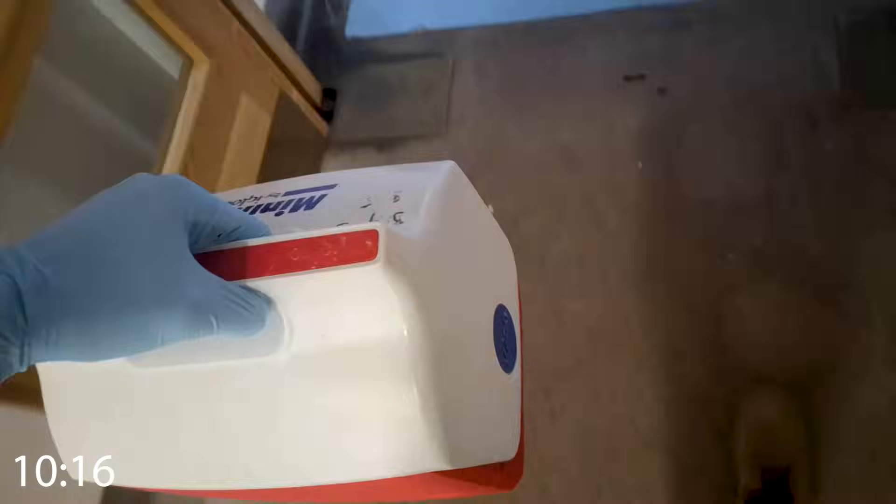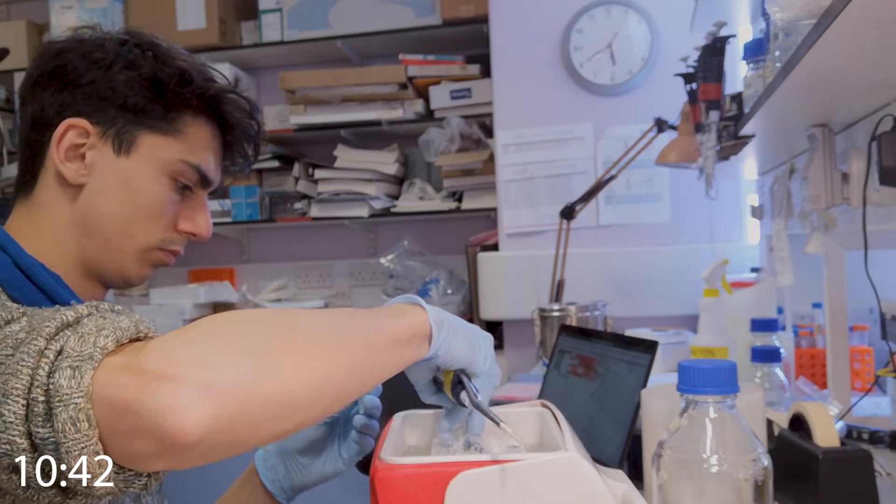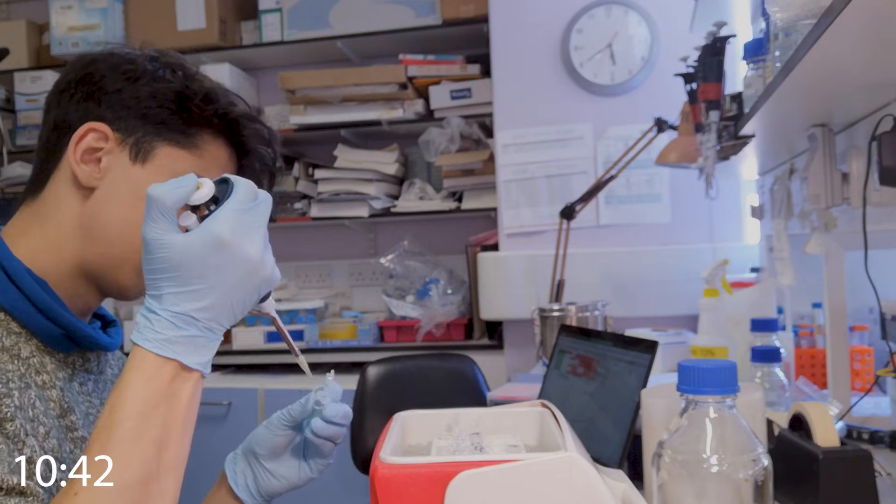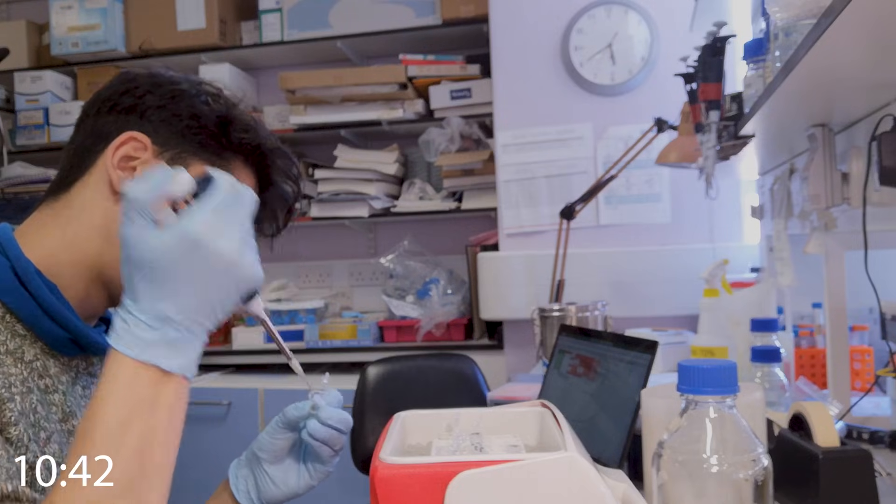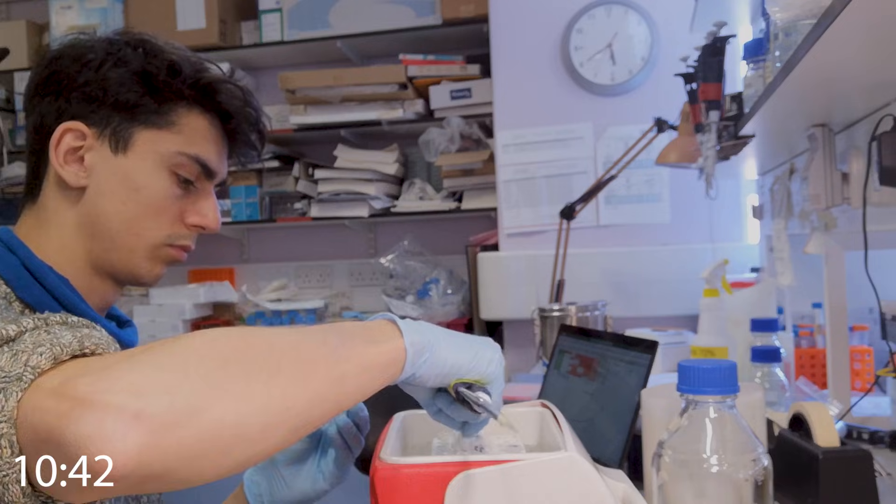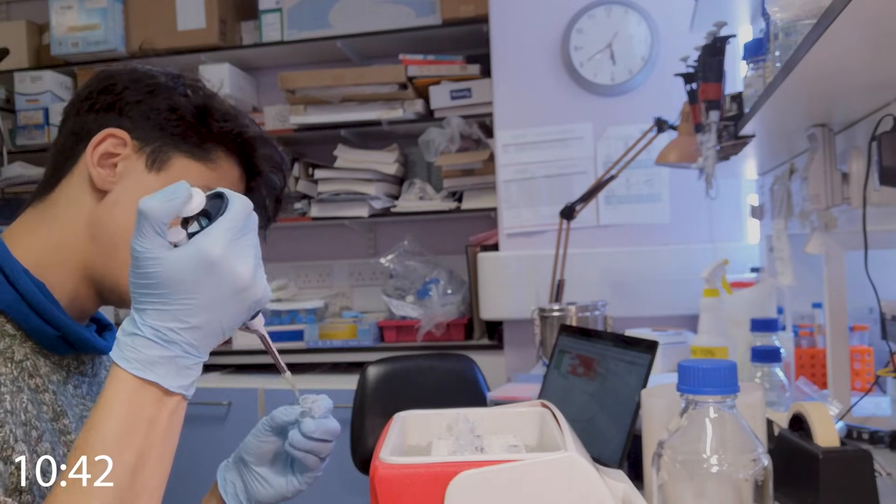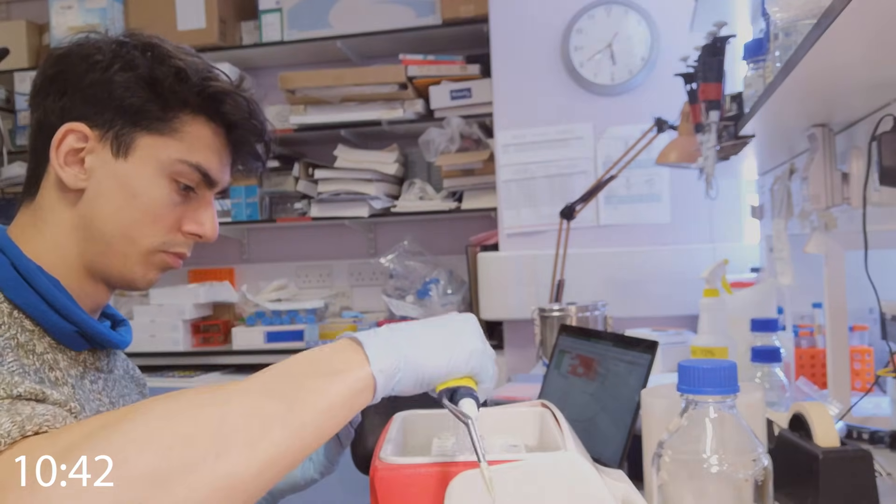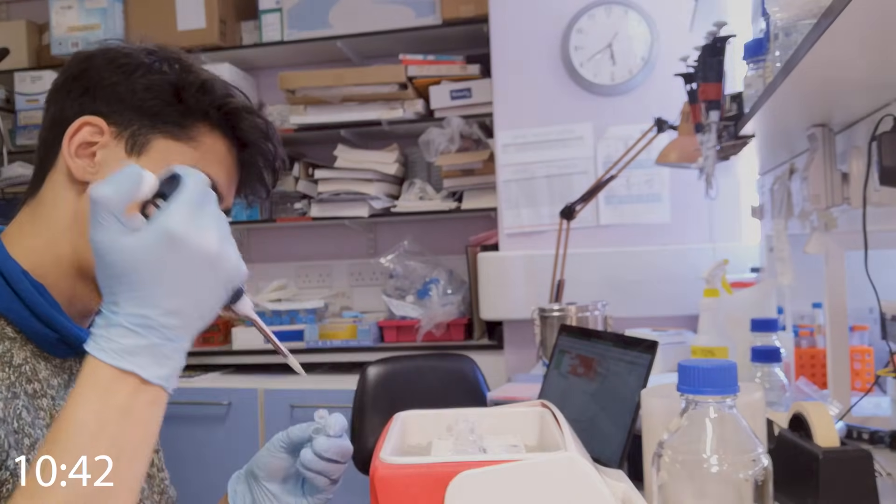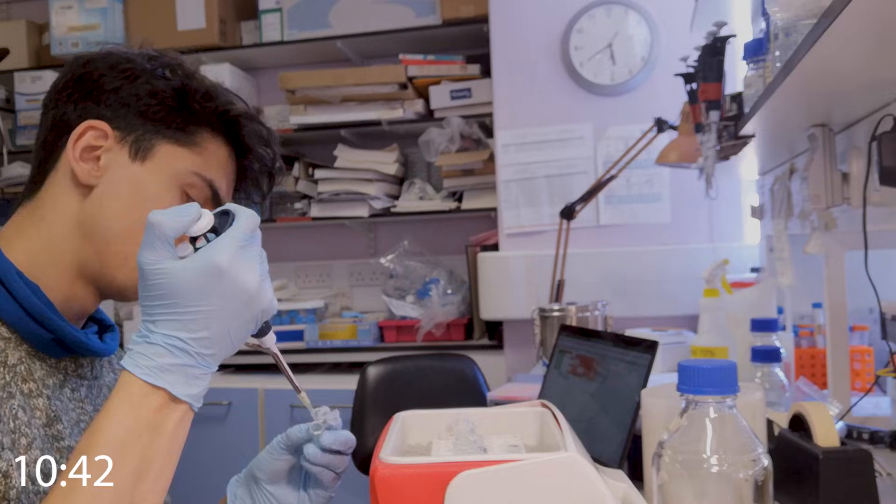Now is probably a good time to tell you a little bit about my work. So I'm a master's student at the University of Cambridge and now I'm based at the department of zoology, although what I research isn't zoology. Every time a cell divides it needs to replicate its DNA, but we don't know about all the proteins and different factors that are needed for DNA replication, which is why I am testing to see if this specific protein called PRMT1 is needed for DNA replication in human cells. And as part of my experiments, I take nuclei from human cells and add proteins to them to see how they replicate their DNA.